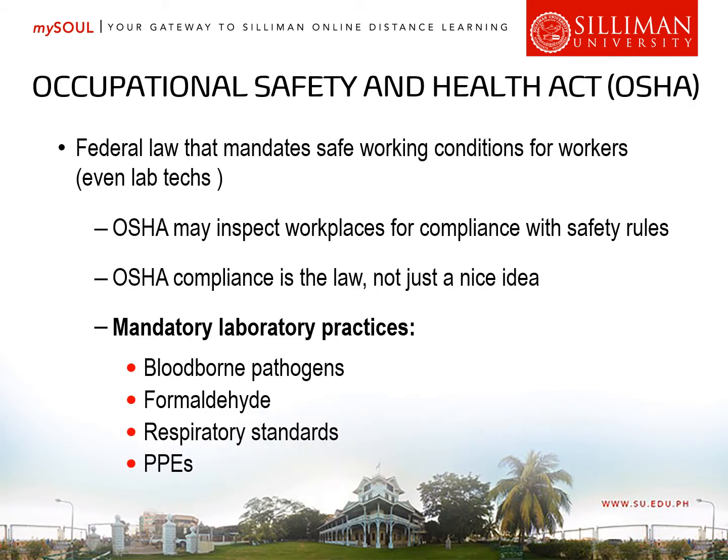Again, we have Occupational Safety and Health Act or OSHA. This is a federal law that mandates safe working conditions for workers, even laboratory technicians. So, people working with OSHA may inspect workplaces for compliance with safety rules, and compliance is the law. It's not just a nice idea. So what are the mandatory laboratory practices being monitored by OSHA? We have the following: bloodborne pathogens, we have the use of your formaldehyde, and then we also have respiratory standards and the wearing of personal protective equipment.